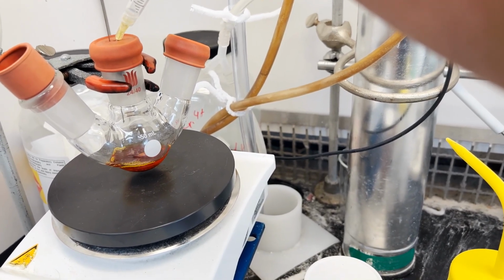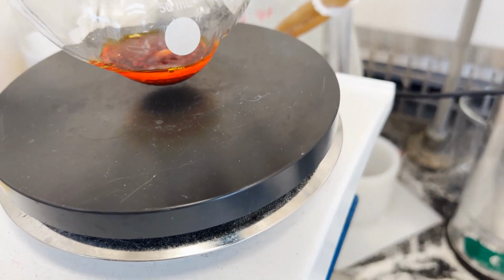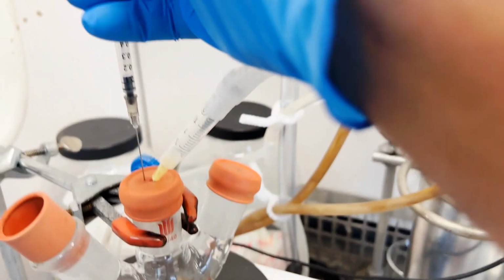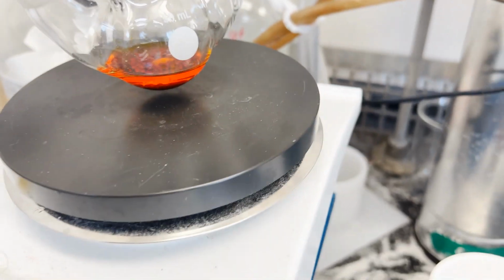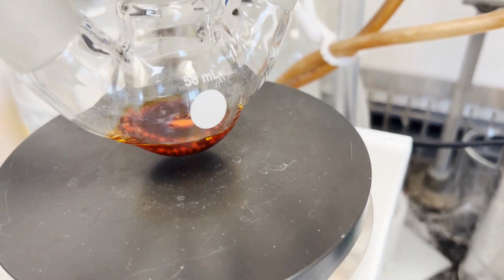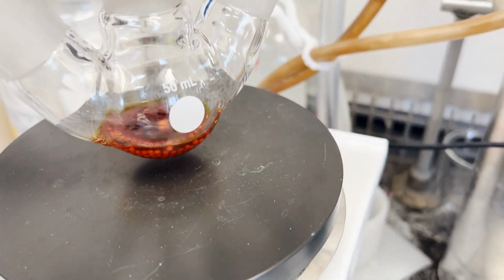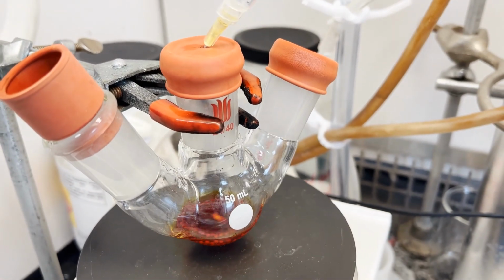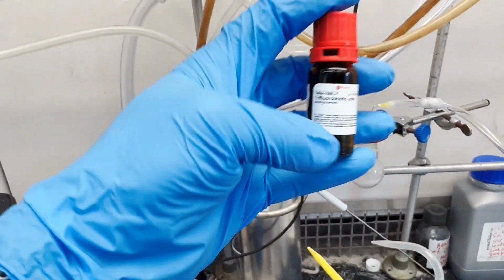So here I'm adding the aldehyde, and once my aldehyde addition is done, I'm going to use a catalytic amount of trifluoroacetic acid to make the reaction faster, as an acid-catalyzed reaction. Once I have added the aldehyde, I will start stirring the magnetic bar. In the meantime, I will also get the trifluoroacetic acid ready to add to the reaction system.